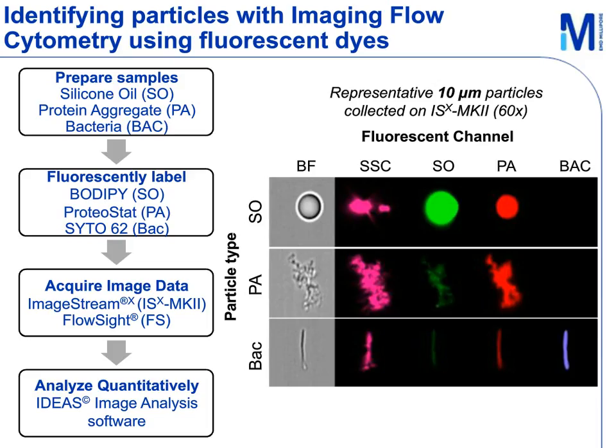The staining protocol developed was very simple and only requires mixing of the staining cocktail containing all three fluorescent dyes at the appropriate concentration with the sample for 30 minutes. We actively pursued development of a simple and wash-free protocol, as washing steps are not only challenging for small particles, they also may affect the final number and size distribution of particles measured.